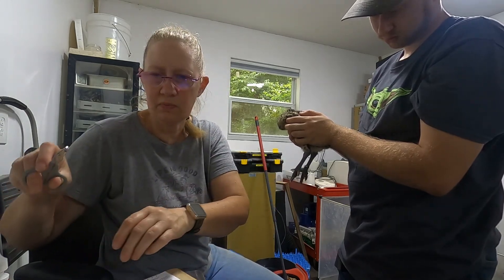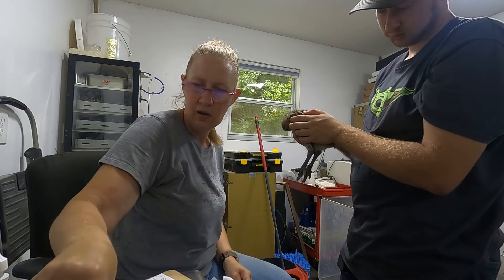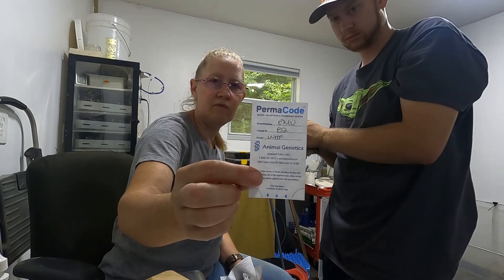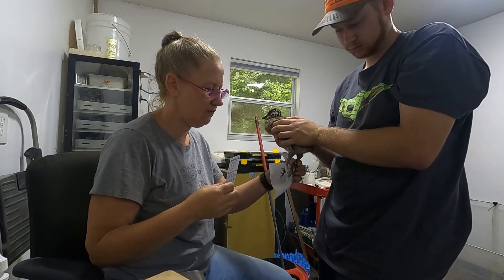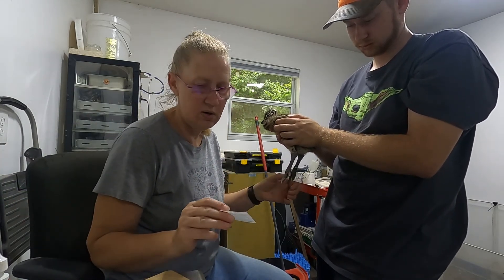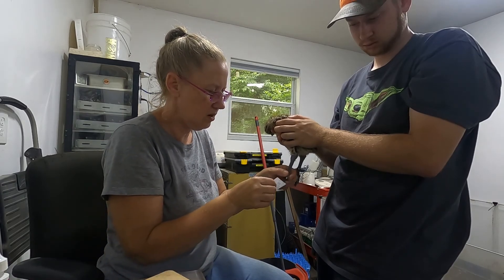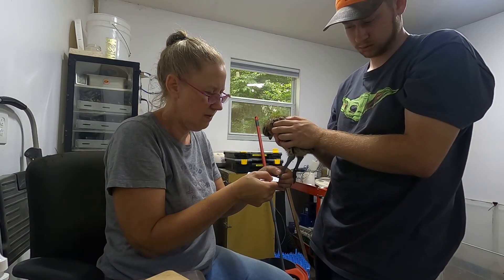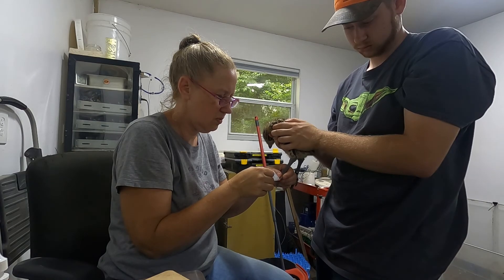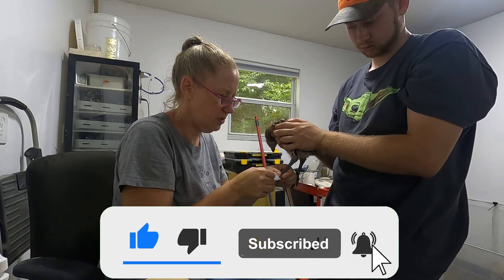This guy's starting to bleed kind of good. I've got some paper towels here to clean things up. We'll let it bleed for a minute. I have done his permacode card with his information on it — his band number is 82. What you want to do is clip the toenail, and down in the corner there are these half little quarter circles. We want to get at least half of that circle covered in blood, so we'll go in and fill this semi-circle in with a nice bit of blood sample.